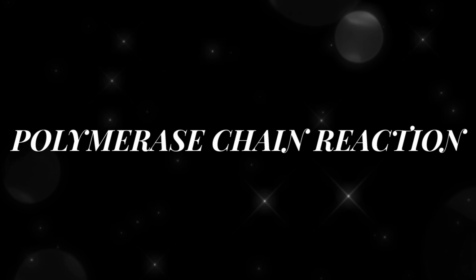Without further ado, today's video will focus on explaining a very, very crucial technique in molecular biology, which is called polymerase chain reaction, or PCR for short. From the name of the technique, we see that there are two major key terms in that technique name. There is polymerase and there is chain reaction. Polymerase, which is an enzyme.